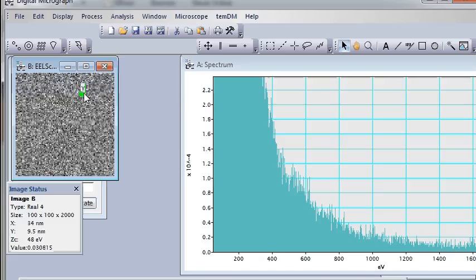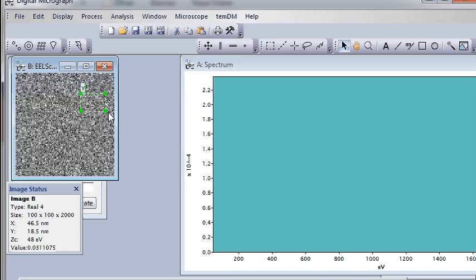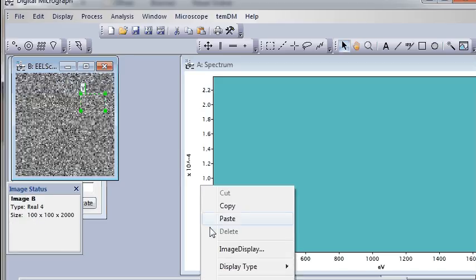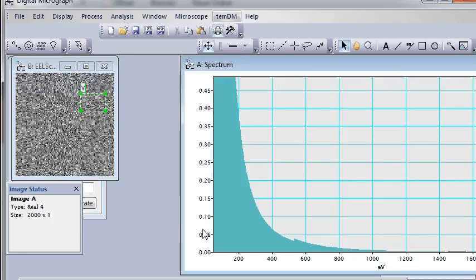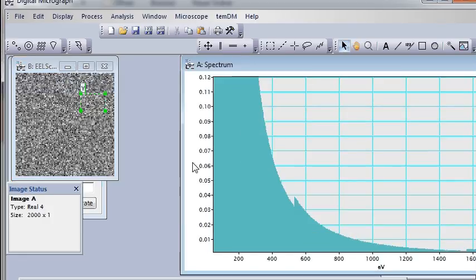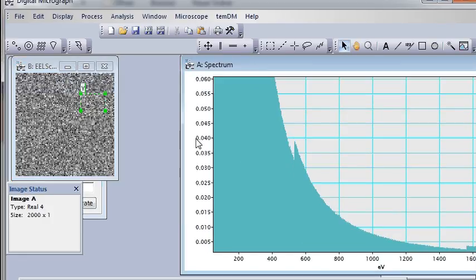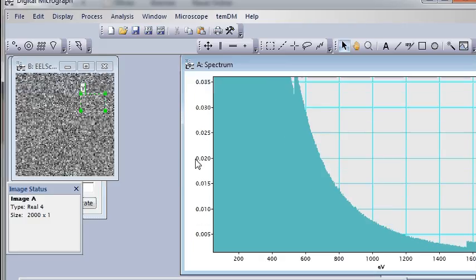But you can extend your green rectangle and then you will see many pixels. Let's try to adapt the scale.